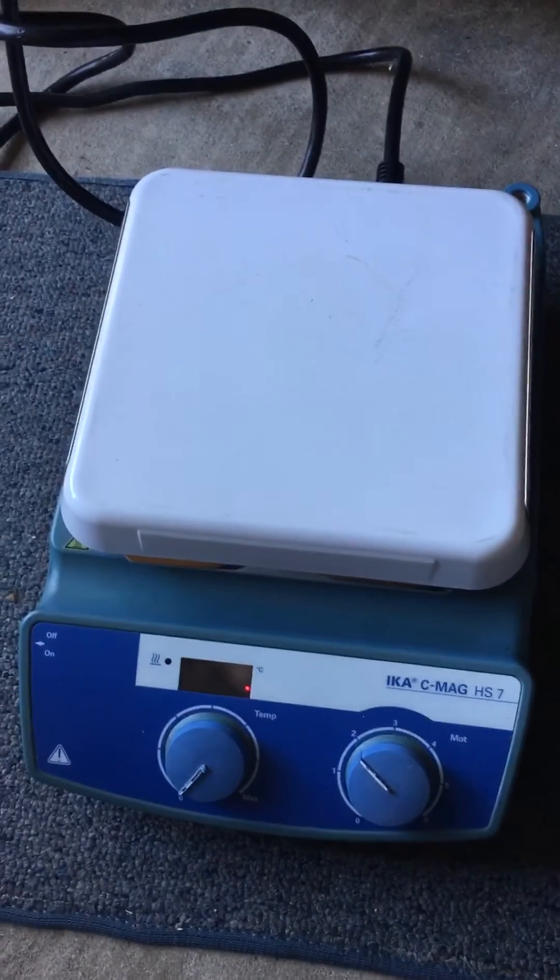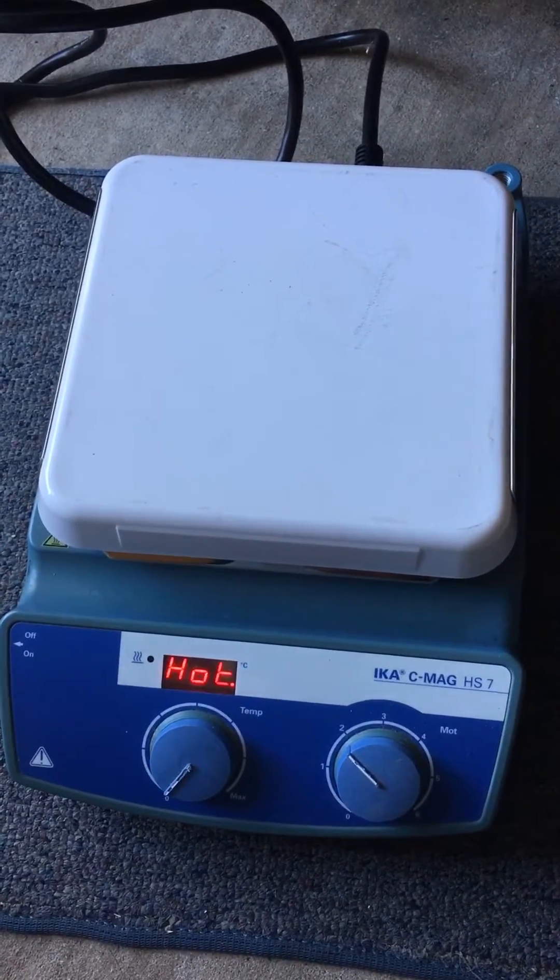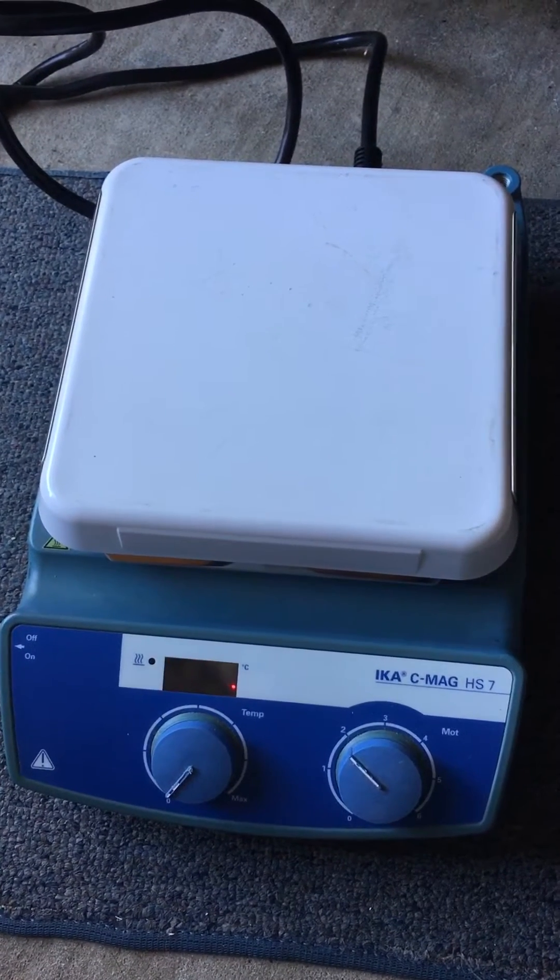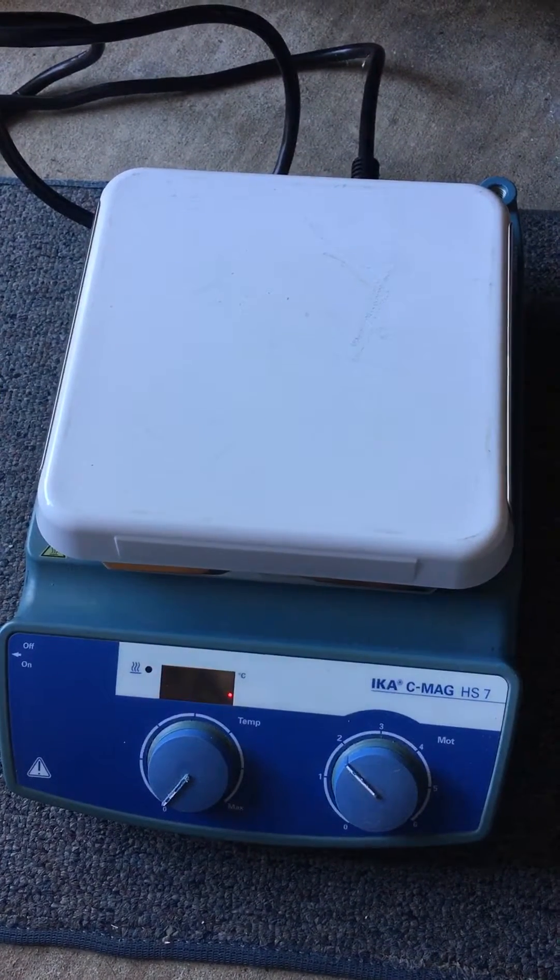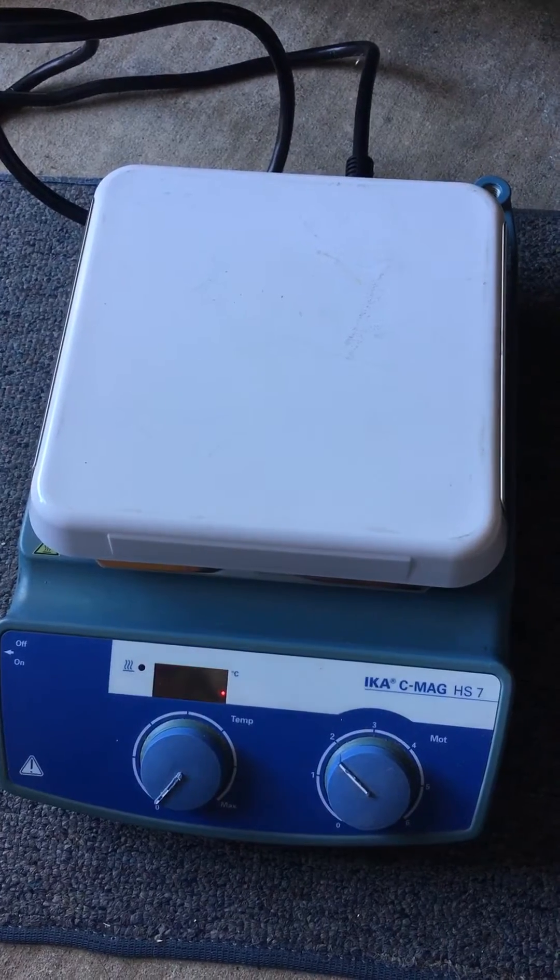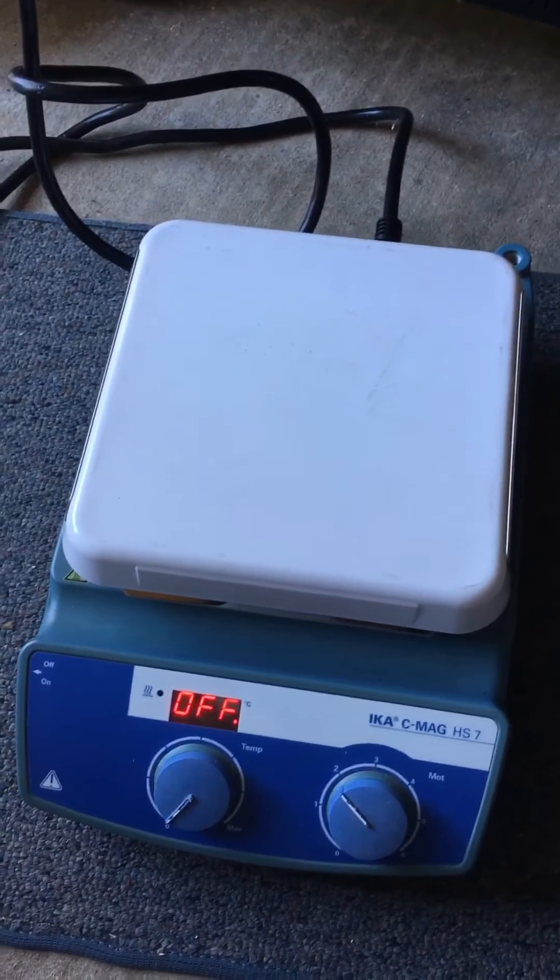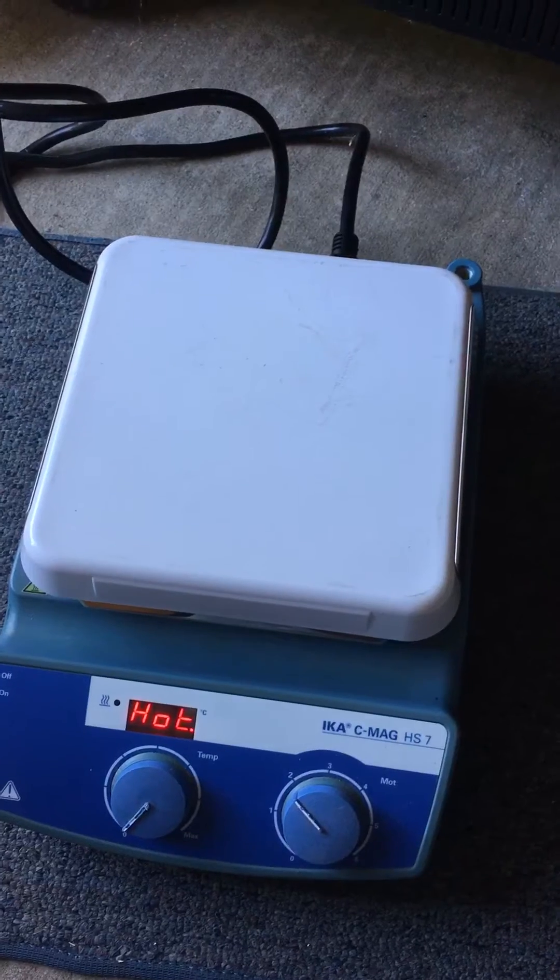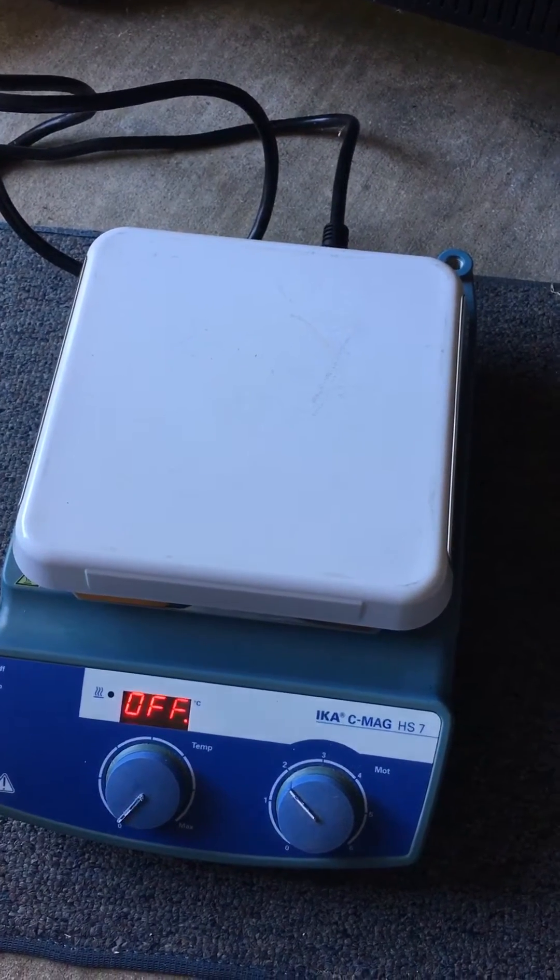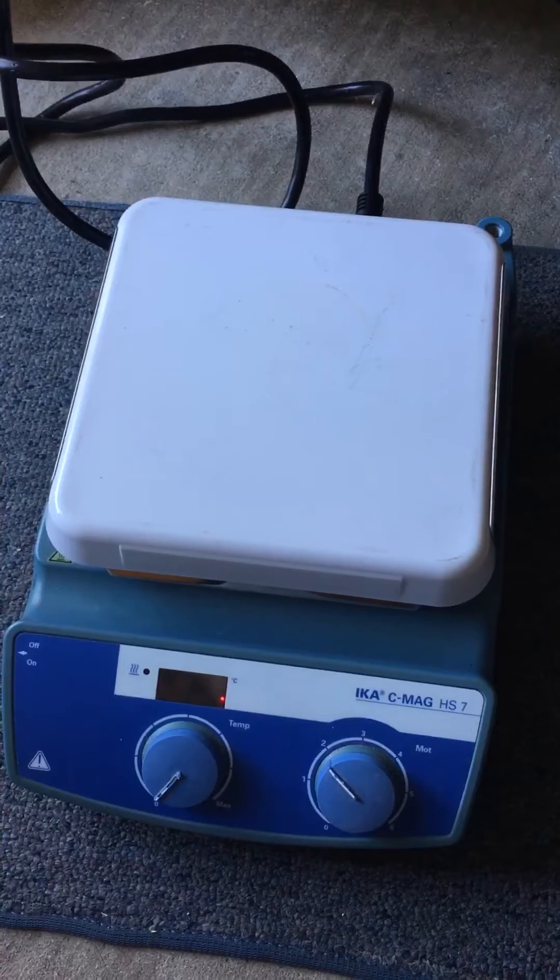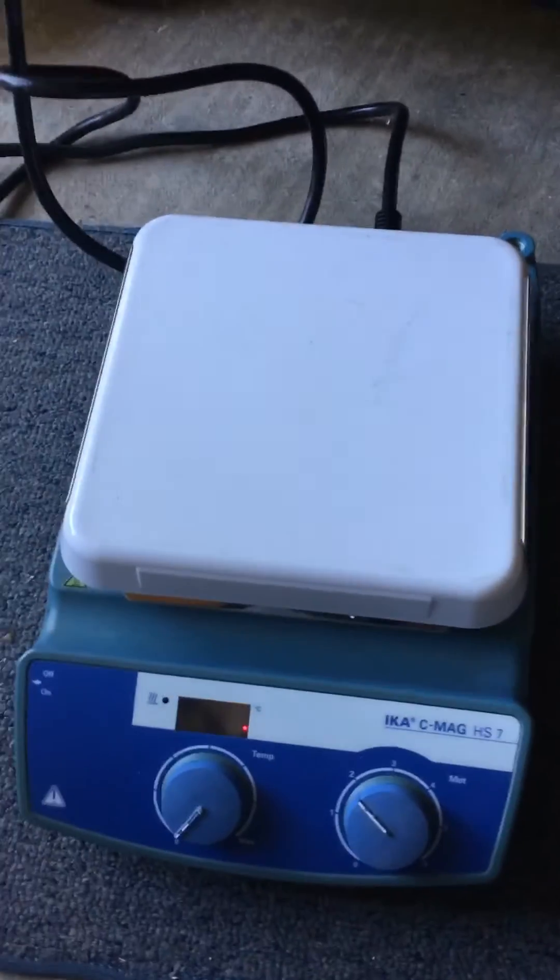Hello, hello! World Electro Parts here again with a new video. In this case, I would like to show you an IKA CMAG HS7. This is called a hot plate magnetic stirrer because that's what it does.